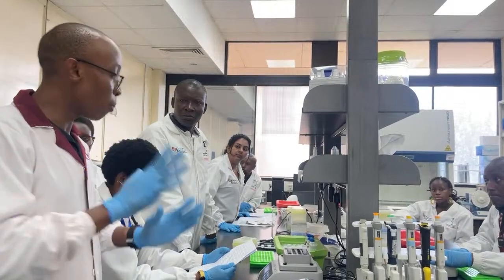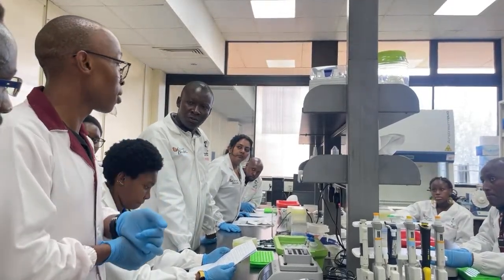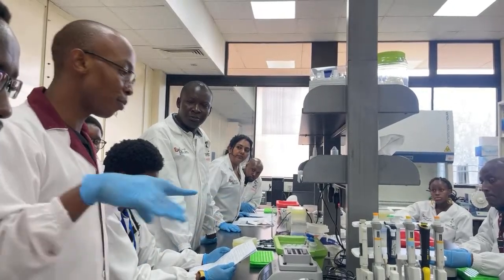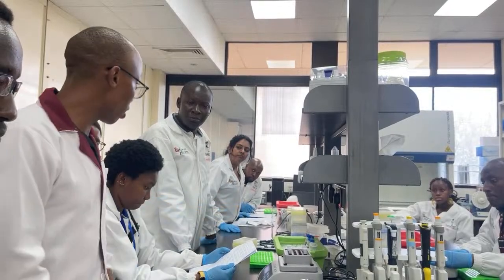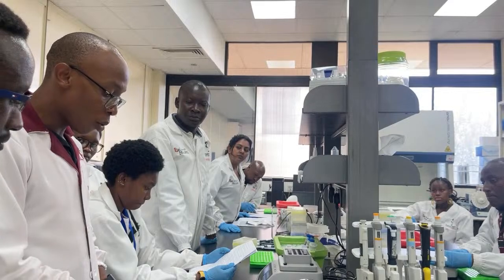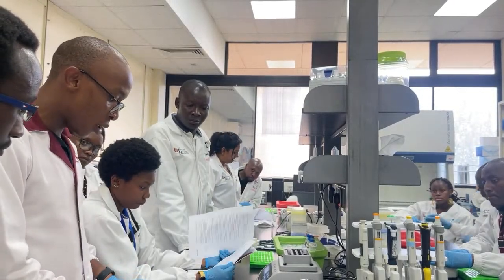So just be mindful that tomorrow in the morning when you take out the tagmentation kits, put them at room temperature. They need to normalize at room temperature. And then we just continue the protocol a few more steps, and then we should be ready to continue.